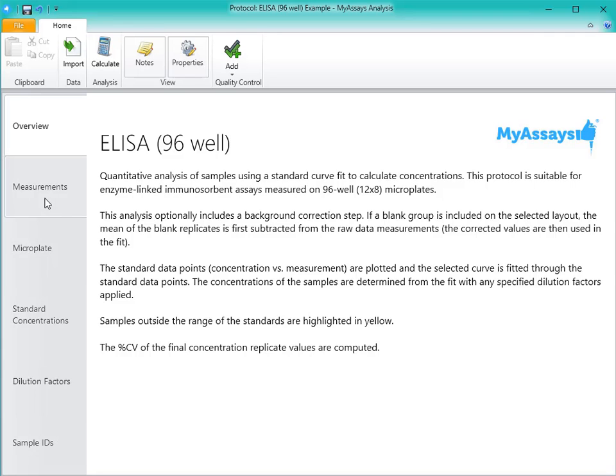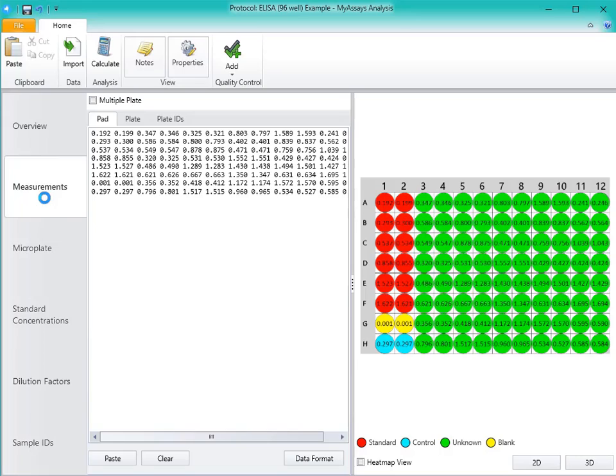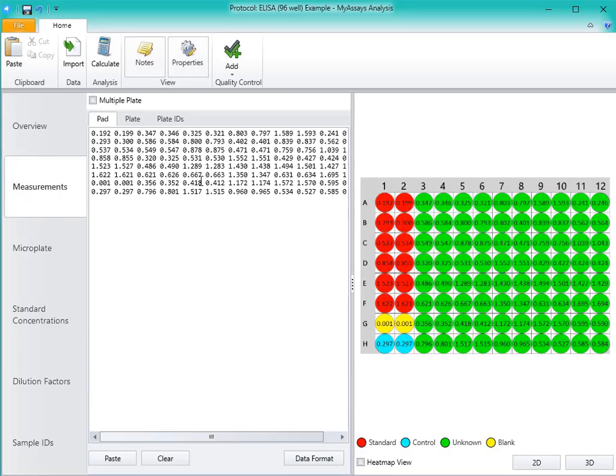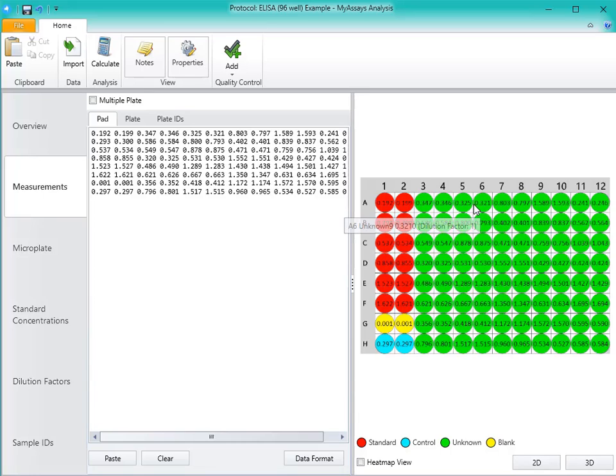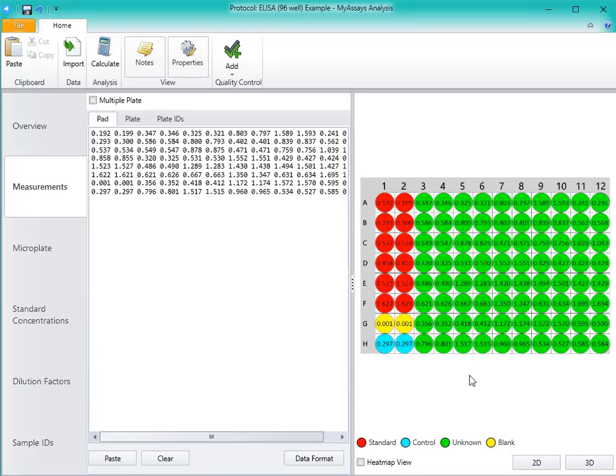Let's start with the Measurements tab. Here you can see the Pad view, which displays the raw results for each position arranged in a 12x8 format. On the right-hand side of the screen, you can see the plate layout, with the raw data arranged with different colors corresponding to different sample types. You can also view this information as a heat map.